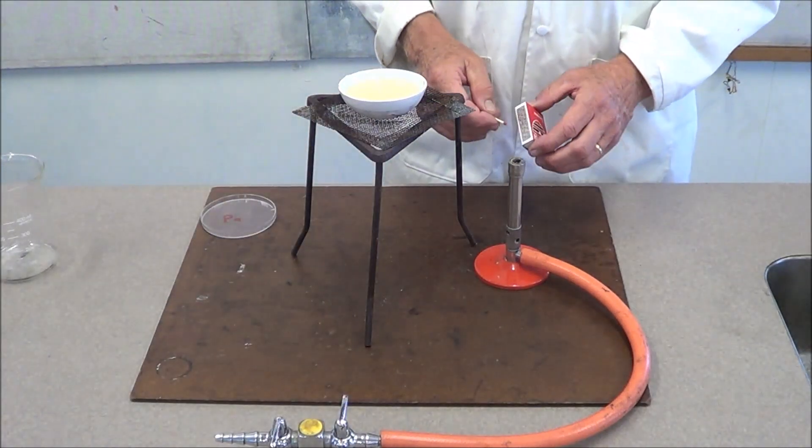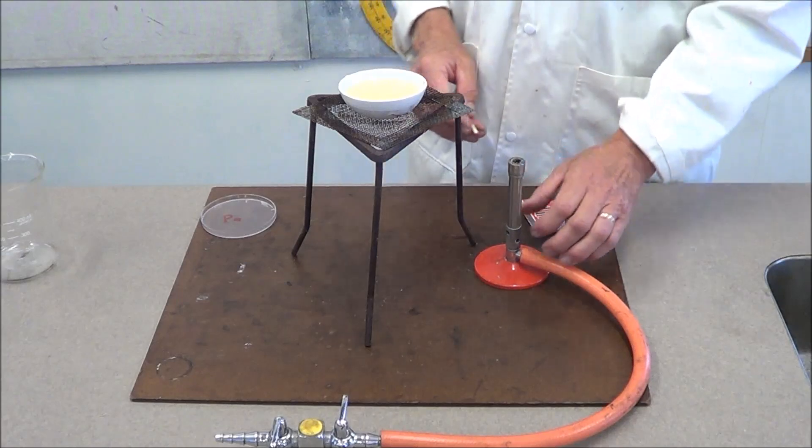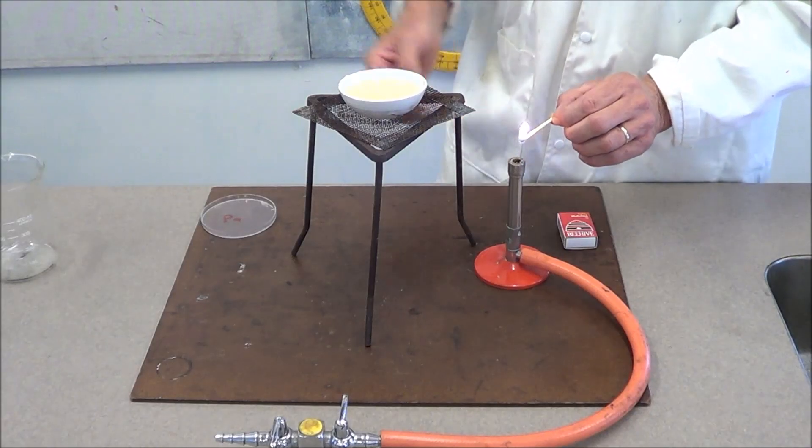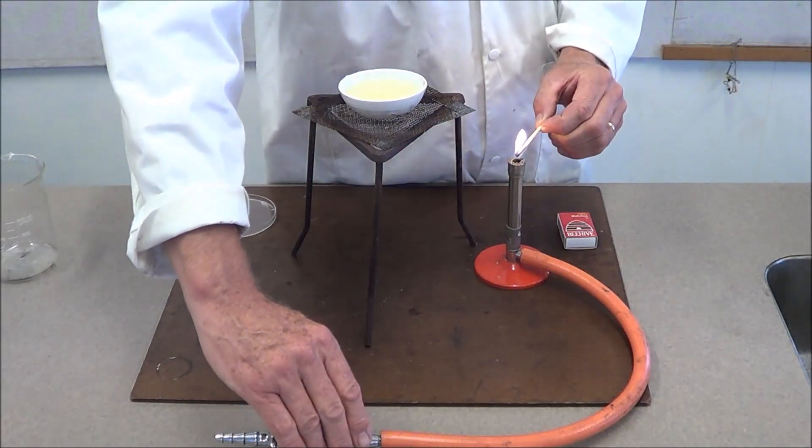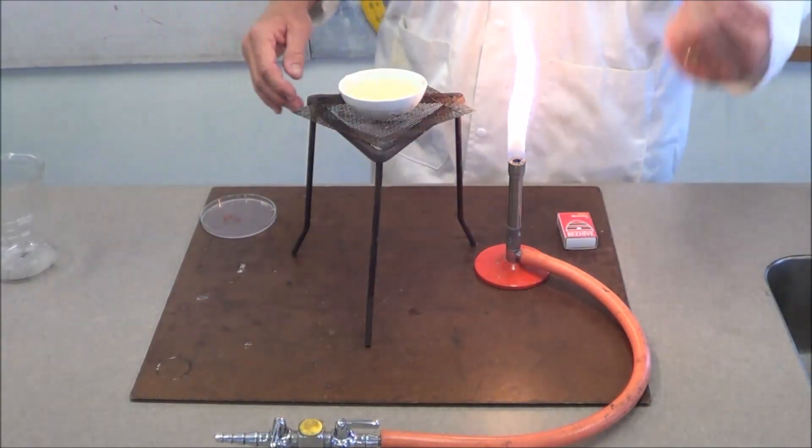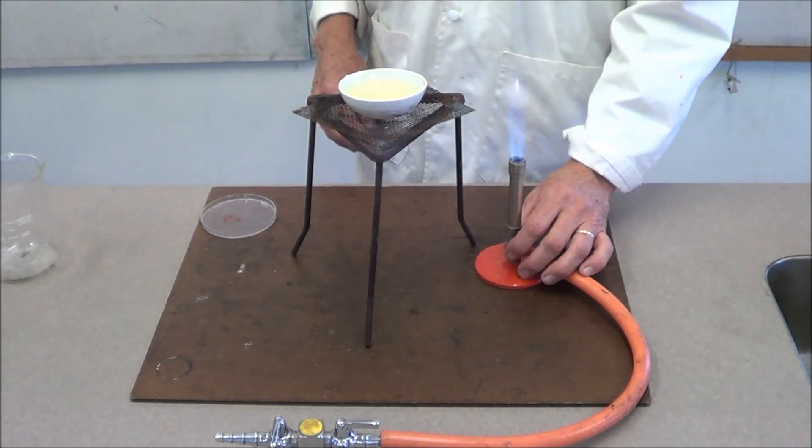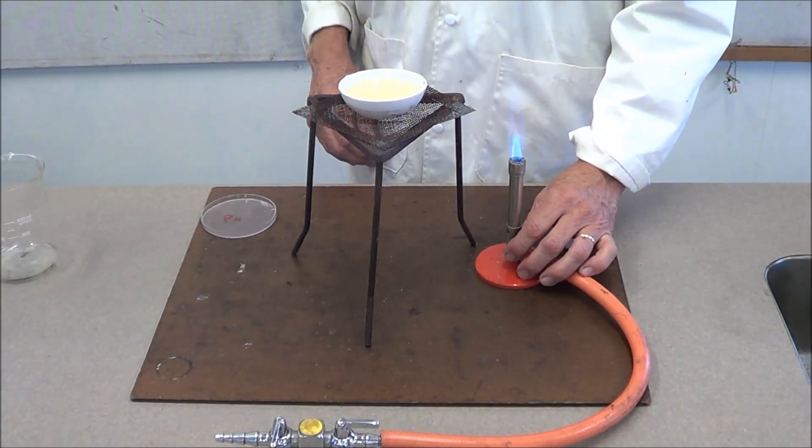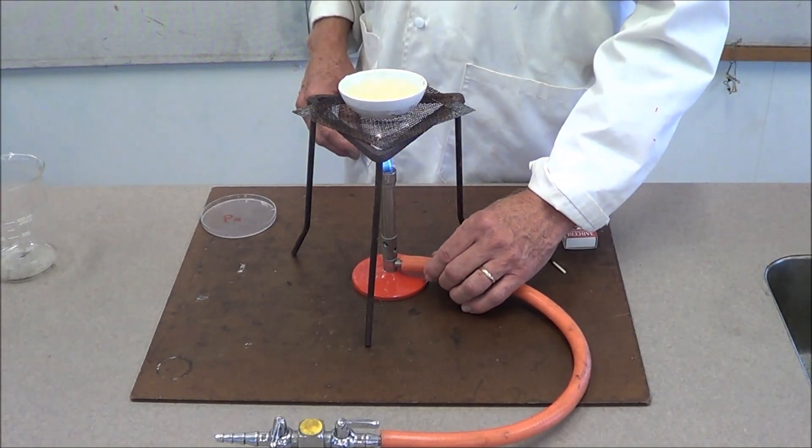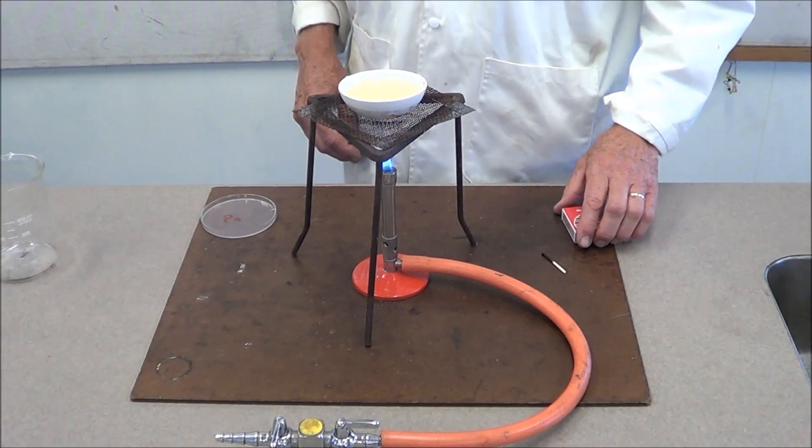Light up your Bunsen. Ensure you've done a safety check on the hose. The air hole is closed and you light it in a safe way. If you're using a flame, you have your flame ready before the gas arrives. Then you turn on the gas and put a little bit of air in there so that we don't get a smoggy room.